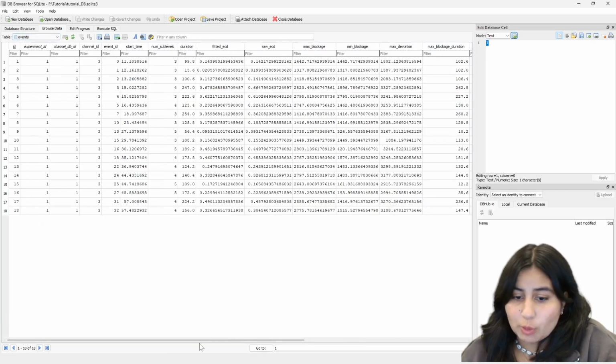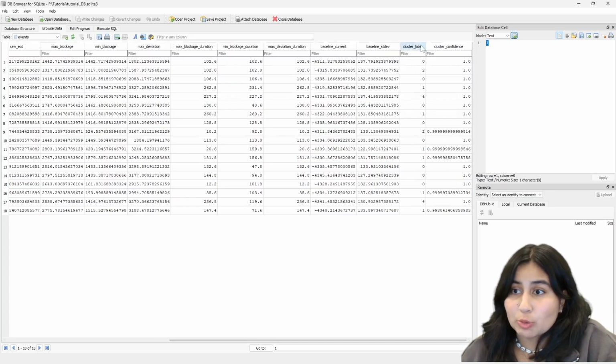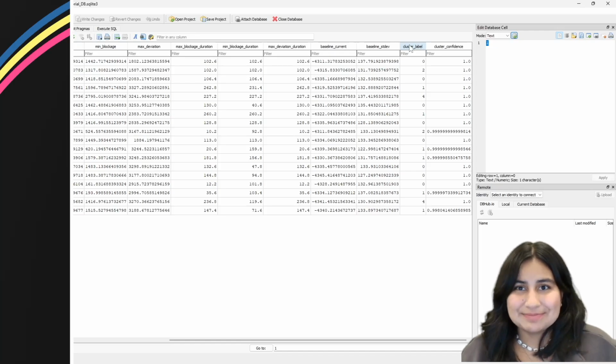So here, just showing you that you can confirm that these aspects were added into your database, and this is where it gets really interesting. We'll see that in part 3, because now these are columns that you can filter by when you're doing analysis in the metadata tab. But again, that is something we're going to look at in more detail in part 3.